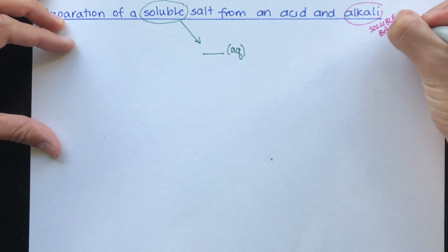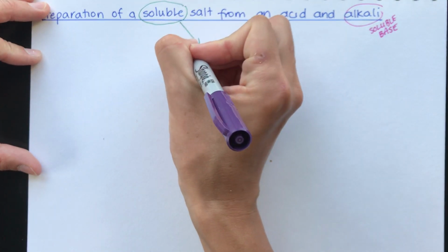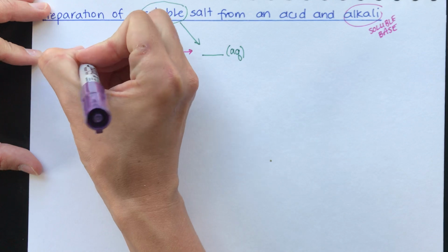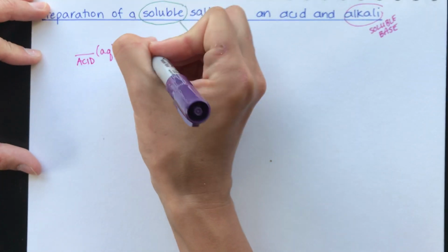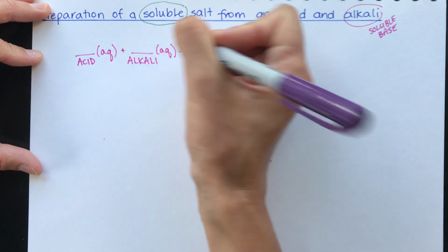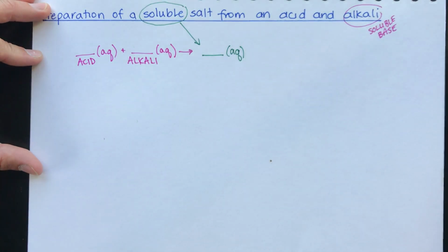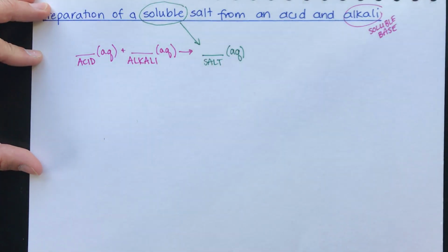And if you remember from the beginning of the topic, an alkali is a soluble base, which means your reactants are going to be an acid, aqueous, an alkali, also aqueous, making salt plus water.